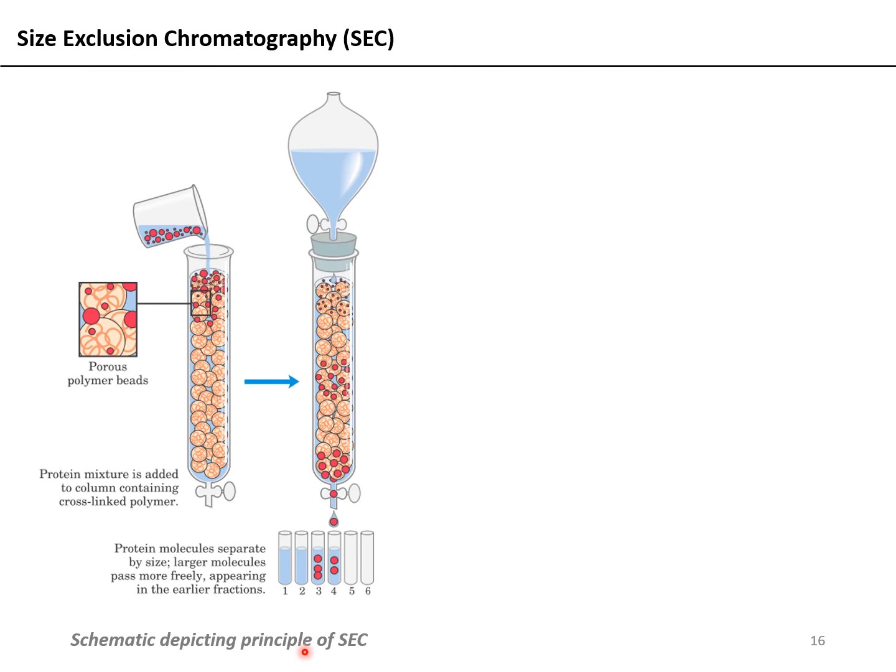Molecules that come out in the void volume do not enter into the pores at all, so therefore there is no resolution. Whatever protein you're getting in the void volume is not resolved, it is unresolved. In order for the proteins to be resolved, they have to enter at least some of the pores. Depending on their size, how many pores they will enter into will vary.